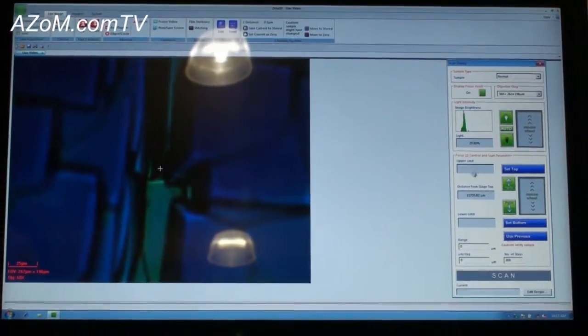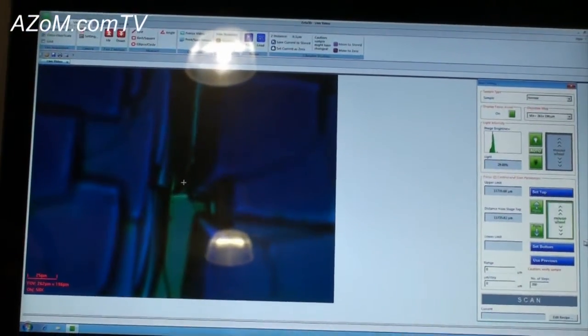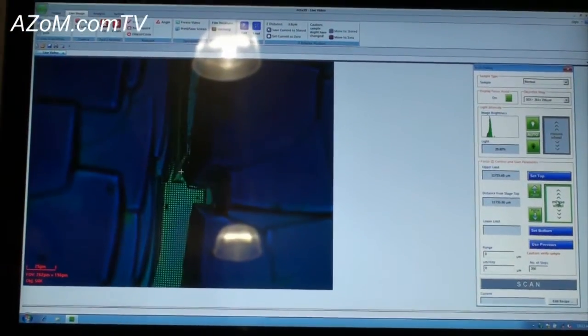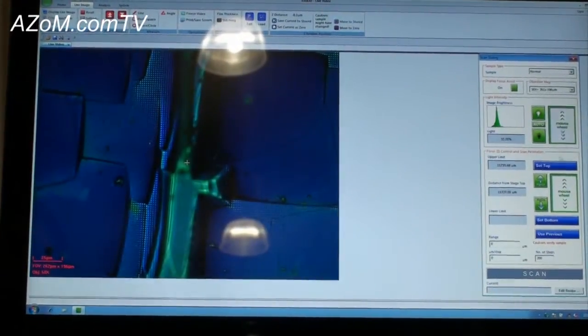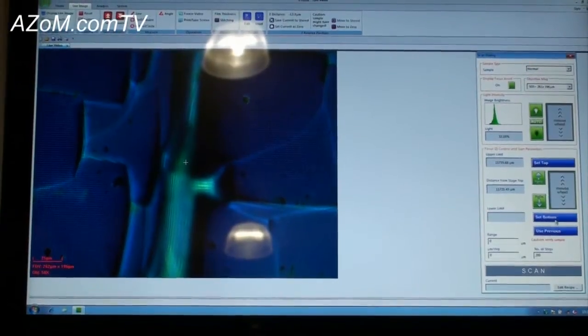To set the Z range, I want to scan through the top through the bottom. So I'll simply set top, and then I'll scan to the lowest point. Might actually give us a little more intensity for the contrast. And then scan to the lowest features. Set bottom.